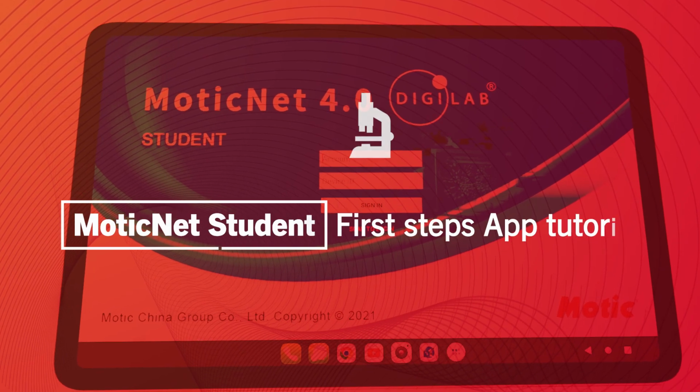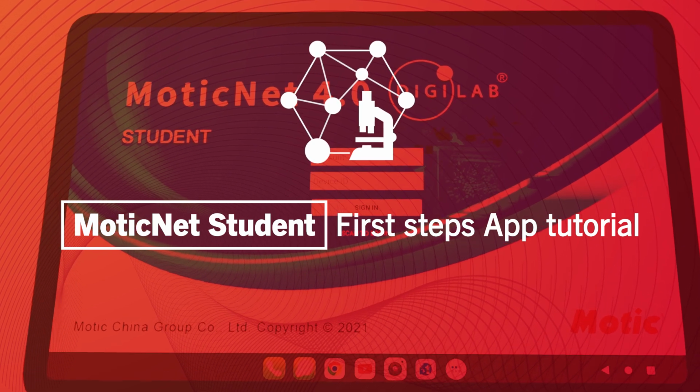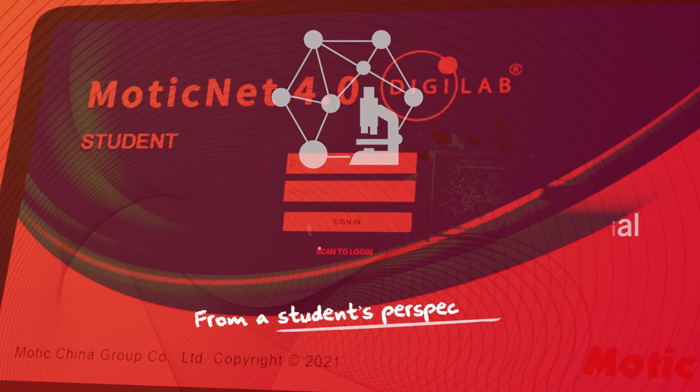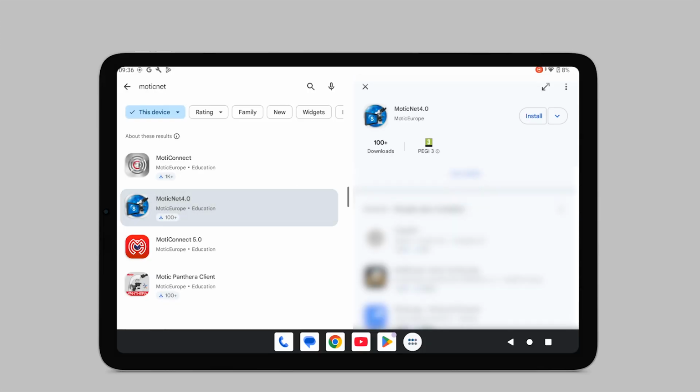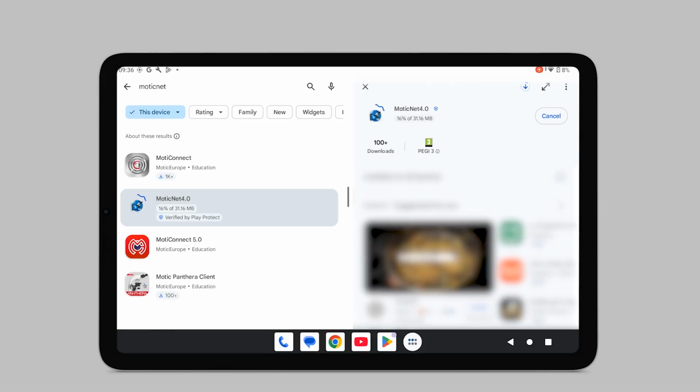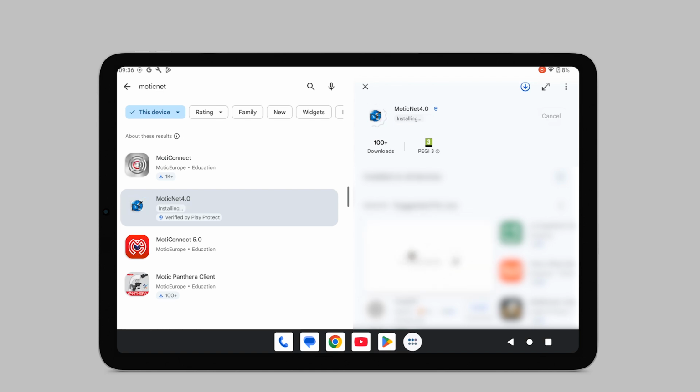Today, we will learn how to get started with the MoticNet app from a student's perspective and explore its main features. You can download the app from the iOS and Android stores. In this video, we will show you the Android version.